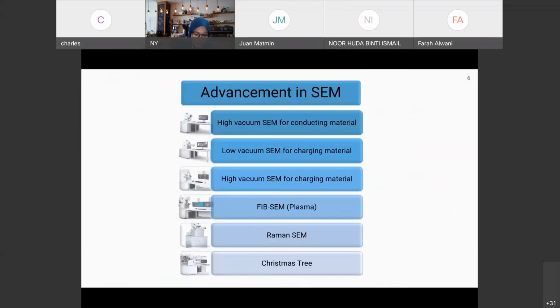So on this page, I'll be introducing how advanced an SEM can be. What we discussed just now, usually that can be achieved or accomplished by a normal SEM. That's why here we have the high vacuum SEM. Bear in mind that an SEM is always in high vacuum mode, so the construction of the column and chamber by default is under high vacuum. This is the most commonly available SEM in the market, used to resolve the level of details. High resolution type SEM falls under this category.